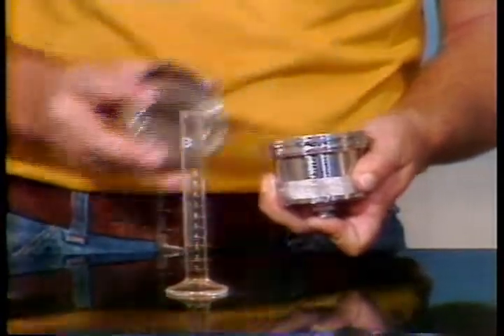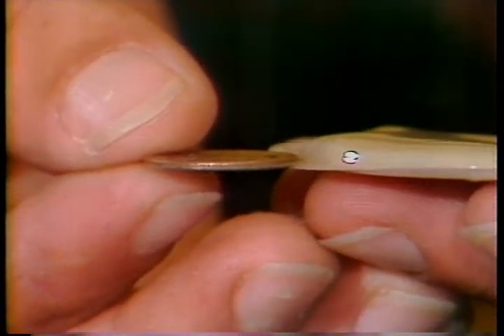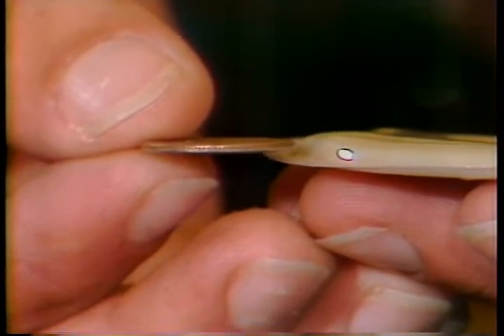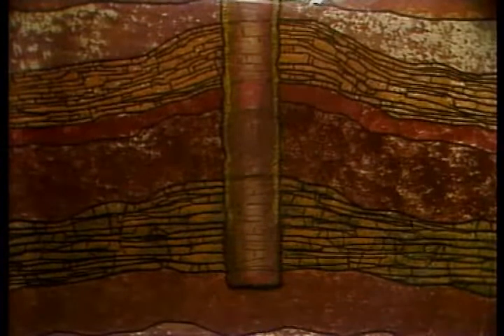Then the lid is unscrewed and the filter paper is removed. This is the filter cake. Here, it's the thickness of the mud layer that got deposited on the paper after 30 minutes. This is recorded too. These two observations tell the mud engineer what wall building characteristics the mud has.